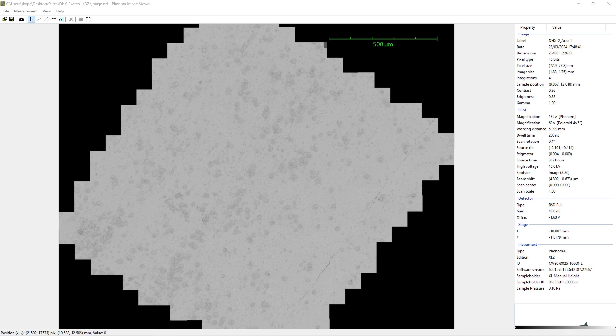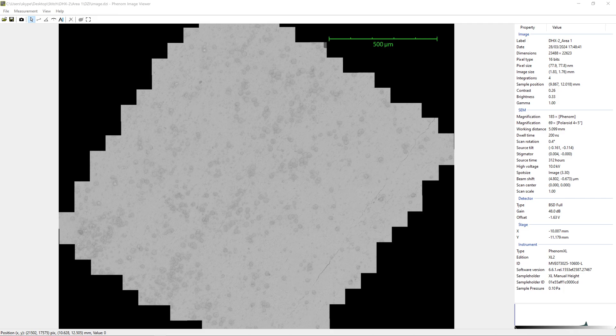So today, this 29th of March 2024, I am releasing a DZI image, a deep zoom image, that took about two hours to capture yesterday, the 28th of March 2024, of a few millimeters squared of Benjamin Huang's reactor, his DHX2 reactor, for your investigative pleasure.